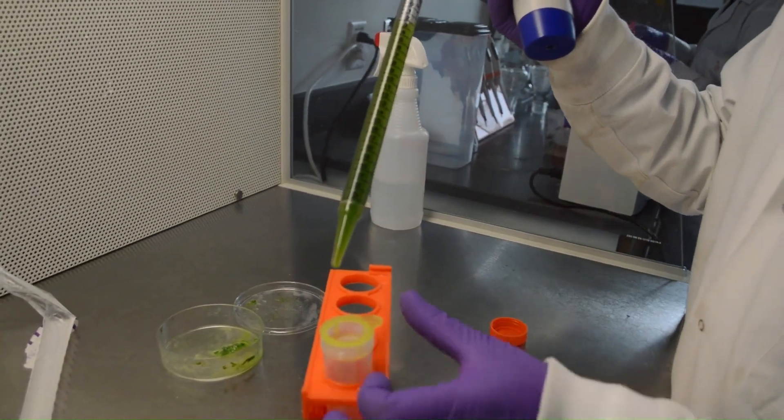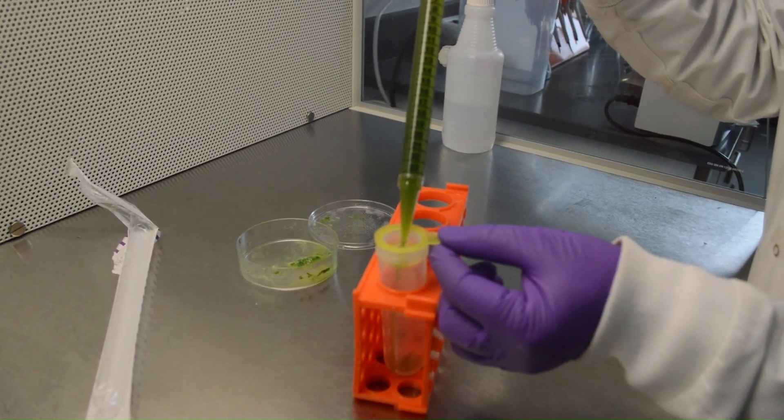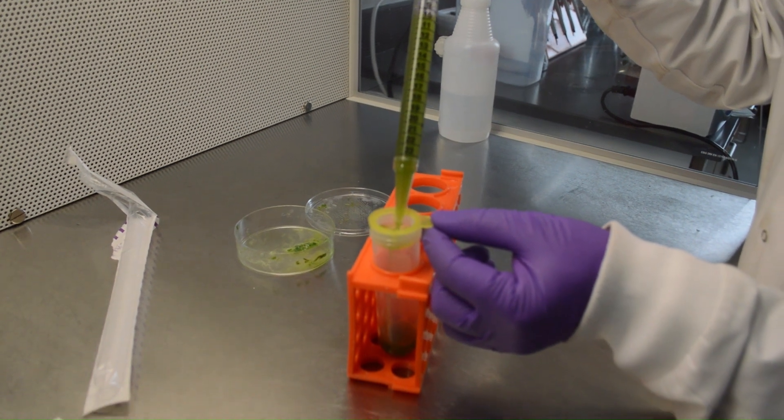Carefully transfer, with the help of a 25-milliliter pipette, the leaf strips into a round bottom falcon tube through a 100-micrometer cell strainer.